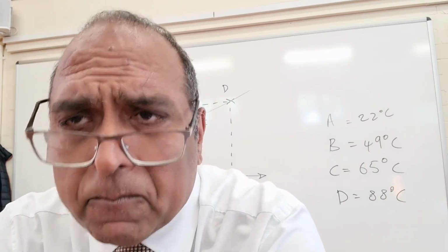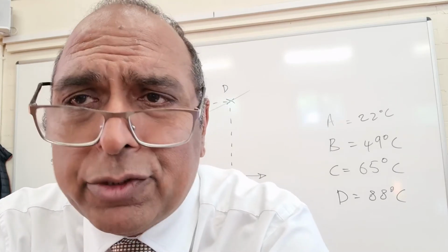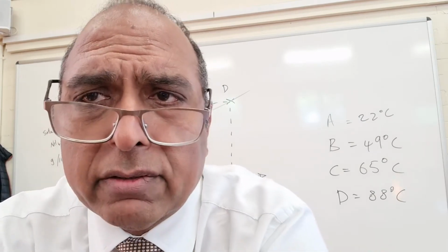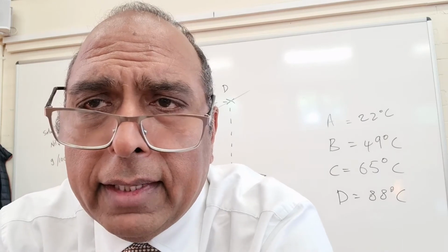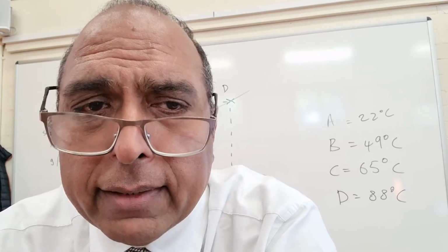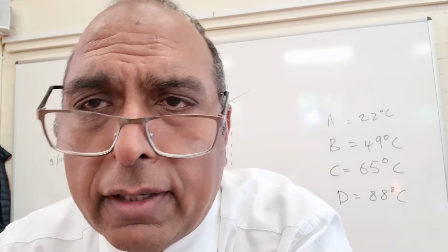Well, we learned from this experiment how to do a solubility curve. And you need to know that for solids and liquids, as the water temperature gets warmer, then the solubility increases. More and more solute can dissolve if the water is warmer. Conversely, if the water's colder, less and less solute dissolves.